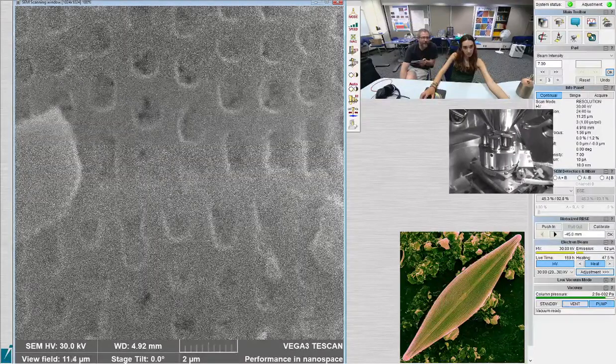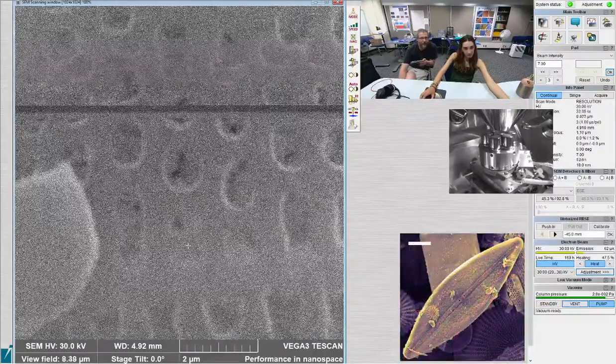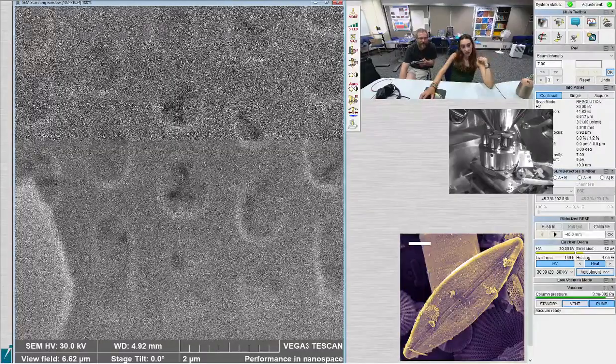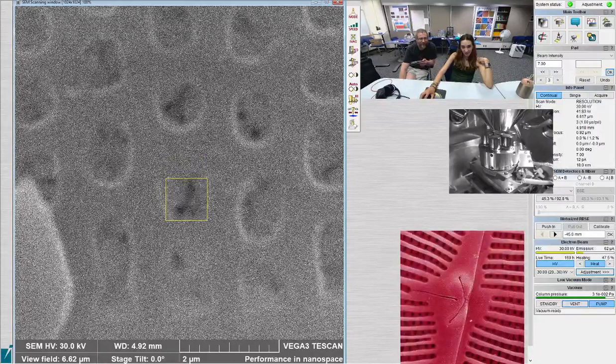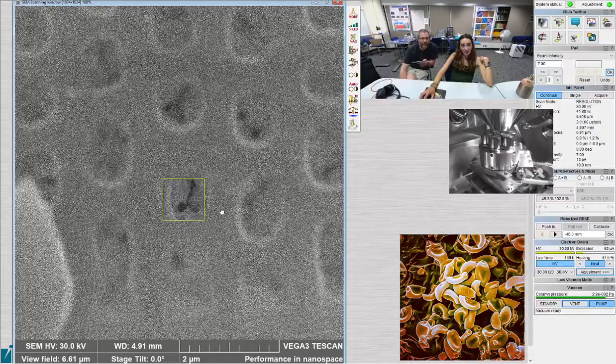Actually, this would be a good thing to try to stigmate on, those little openings. These ones? Yeah, I think there's enough detail there that you could probably do better. Yeah, give it a shot. That's not what I meant. Okay. So try to get it in maximum focus first, and it may be there already. That's maximum. That's good. Wow. That's good. So now I go to this one, yes? You'll probably need to zoom in to stigmate it better than that, actually.